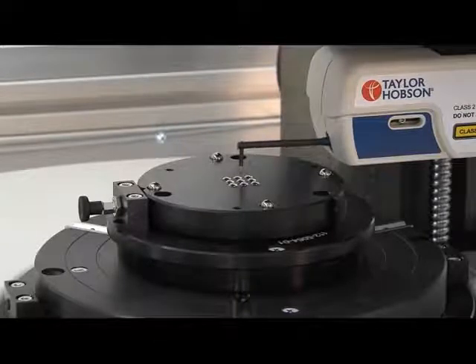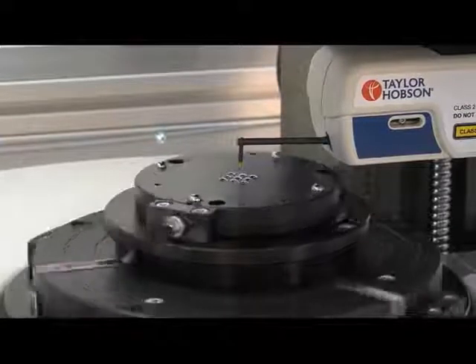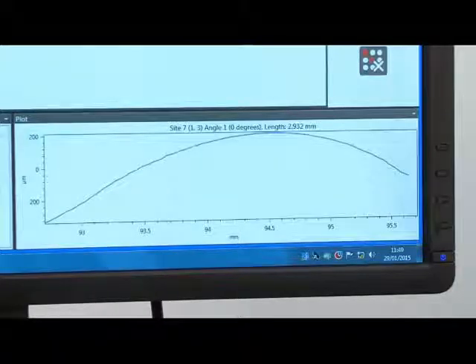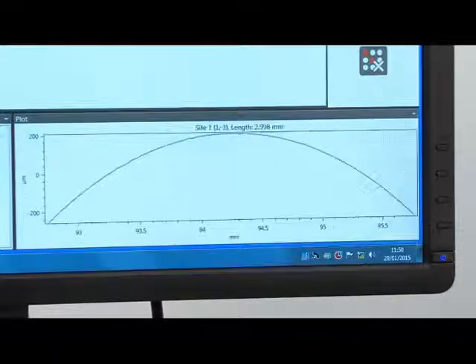Batch parameters of PT, RMS, radius and slope can all be set as tolerances. A live trace is displayed as the data is collected, giving you instant feedback on results.